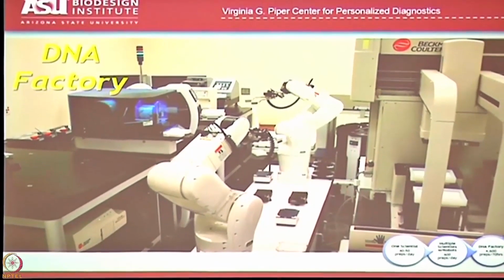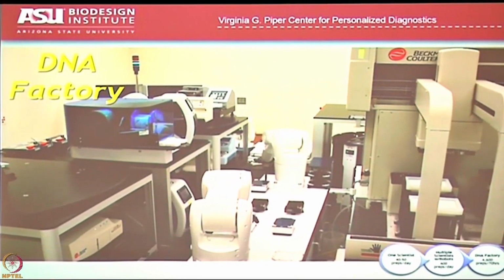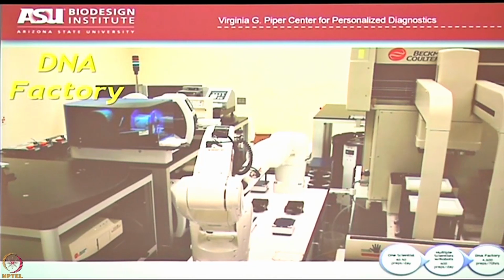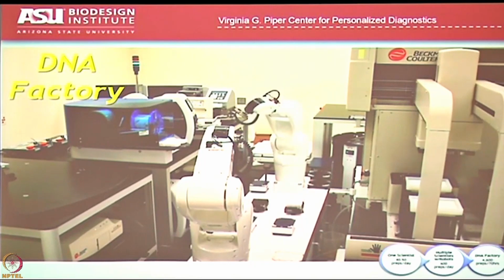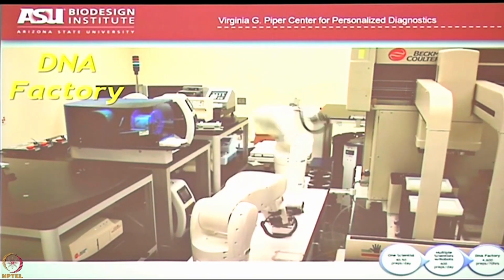And let me see if I can make this go. Is that going? Yeah. So this is what we have in Arizona now. In the basement where my lab is located, this is a fully automated platform for growing DNA and purifying it. The camera is sitting on an incubator shaker that grows the bacteria with the DNA in it. This particular shaker has a specialized door in the back so that these robot arms here can reach in and take out each one at a time as it needs to, and they pass it back and forth on that platform there. So this guy's handing it off to this guy, so he's going to pick it up now.